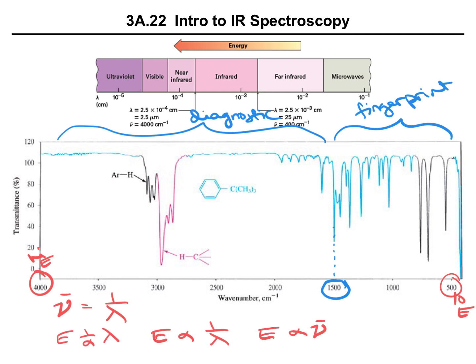And finally, we can think about some different zones within the IR spectrum. So from around 2700 up to 4000, this is where we have bonds to hydrogen. Around 2100 to 2300, this is where we have triple bonds. Here around 1600-ish to 1800, we're looking at double bonds. And then down here, we are looking at single bonds. And this all refers to stretch. So this is a something-hydrogen stretch, triple bond stretch, double bond stretch, single bond stretch. The bending vibrations that I'm aware of are also down in the fingerprint region.